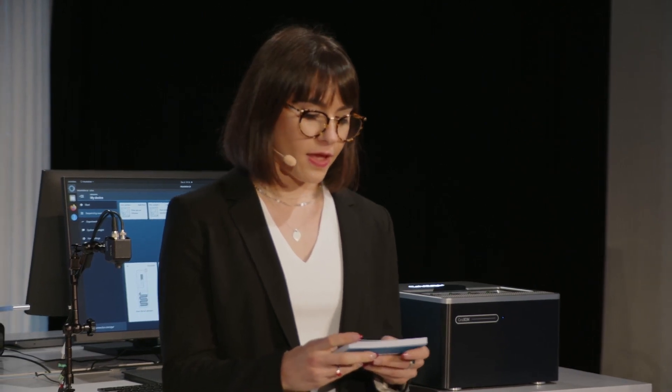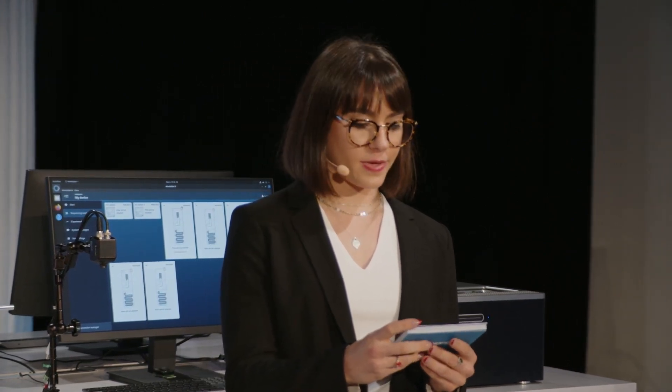Today, I'm excited to present a fascinating product workflow that focuses on using Oxford Nanopore products to do end-to-end sequencing and analysis on human genome samples. This journey will take us through some new chemistry developments, as well as new analysis tools that contain features that make this analysis more streamlined than ever before.